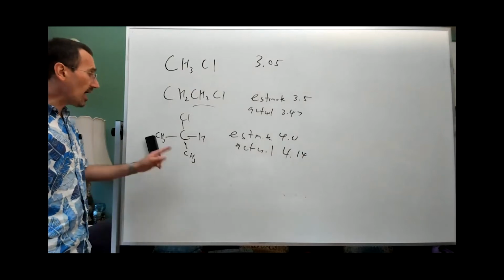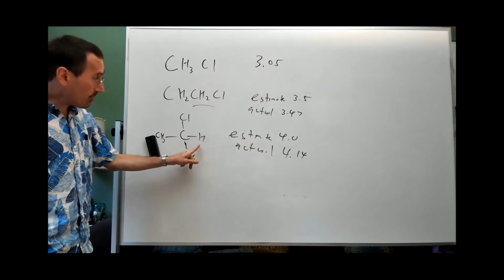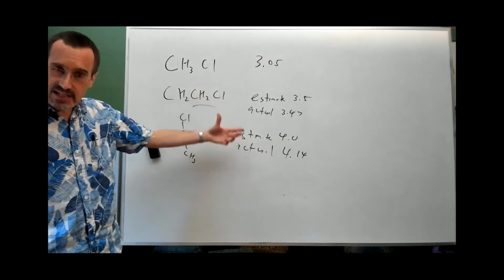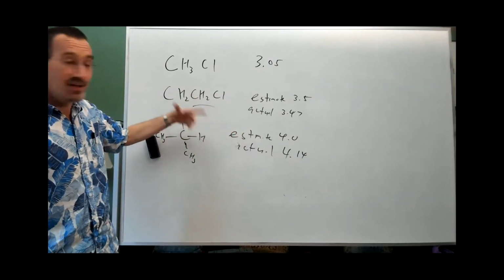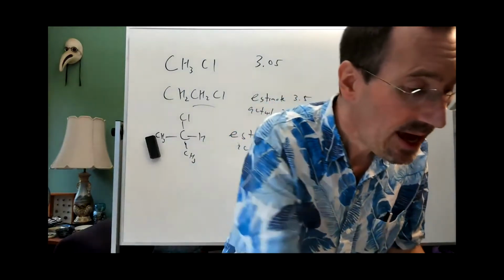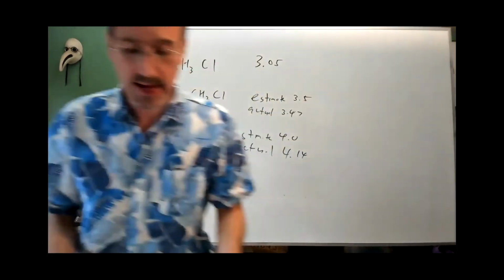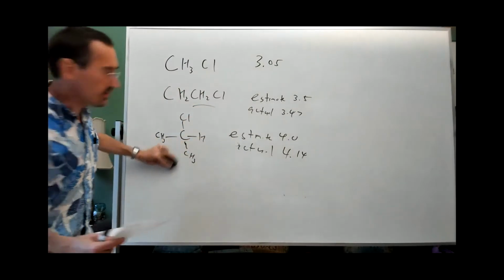By the combination of seeing a septet at about 4 parts per million, you'd say, oh, that's an isopropyl group with something electronegative on it. That's really, really useful. And the good news is you only have to keep one number in your head, and then you can build out the other numbers that you need.